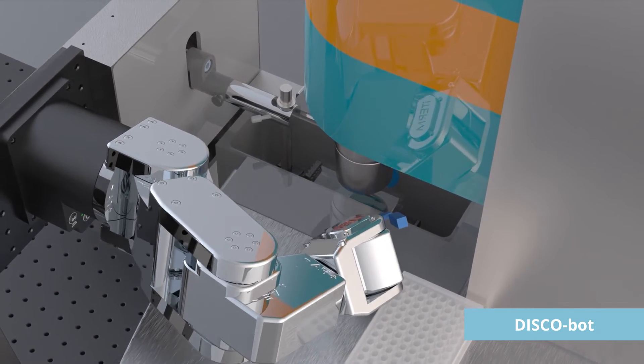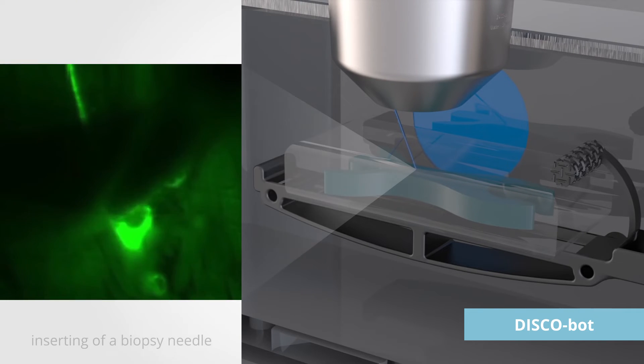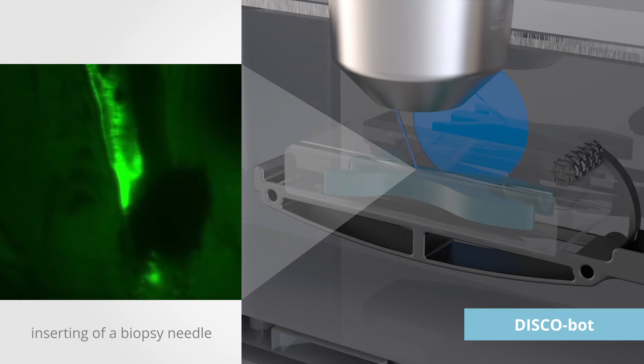In this process, DISCO-BOT communicates with the imaging system. It inserts a biopsy needle to extract regions of interest in quick succession.